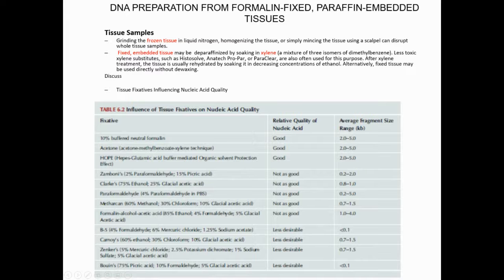So we archive the biological sample from the patient as the FFPE block.